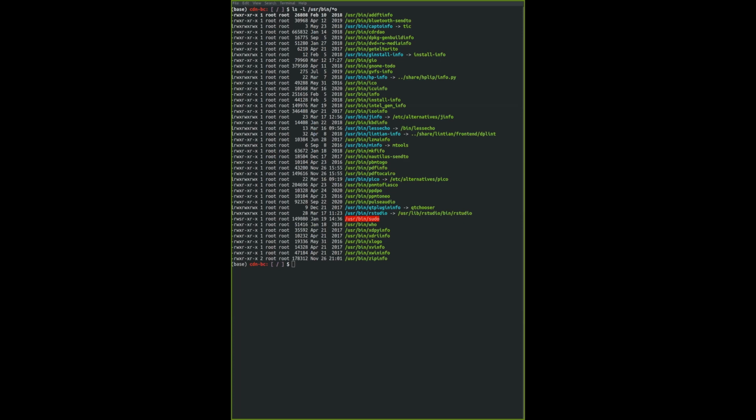So Ali is getting this error that says no such file or directory. Sometimes it might be due to you not having files that begin with A. But if you do have this file somewhere, do try with other letters and see if other letters work fine, because sometimes it's just a matter of naming of the files. So Ali, give that another try.